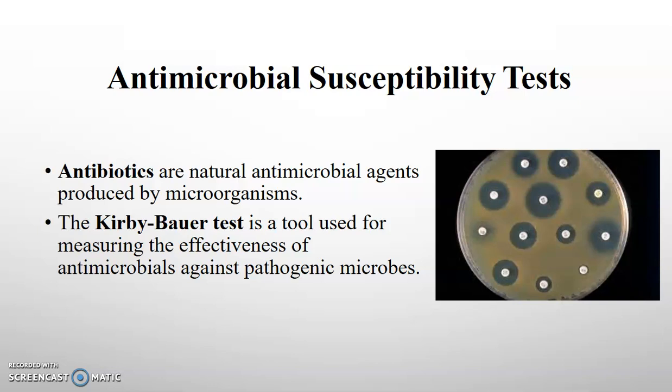So like I said, we're focusing on the Kirby-Bauer test. This is a test that looks to see if antimicrobial drugs, which are antibiotics in this case, are effective against different microorganisms. Basically what you do is you put a sample of bacteria on a plate, and then you put these little antibiotic discs that we see here on the plate with the bacteria, and you incubate it for a period of time.